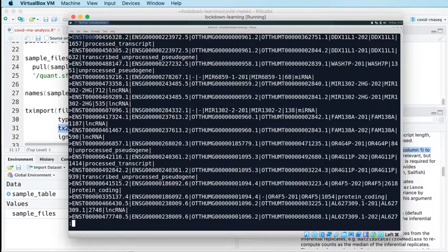So these are our sequence identifiers, and you will see that, for instance, these first two, ENST456328 and 450305, both belong to the same gene. Okay, their Ensembl Gene identifier for each of those two is the same. Okay, and then we've got a gene which is comprised of one single Ensembl transcript ID, and then another one, and then this one here consists of two as well.